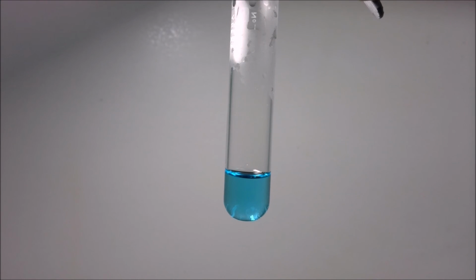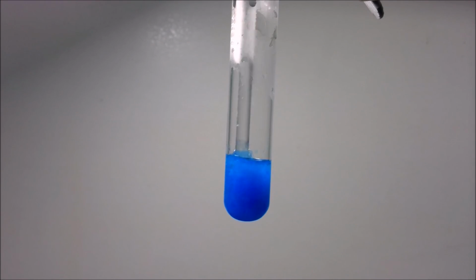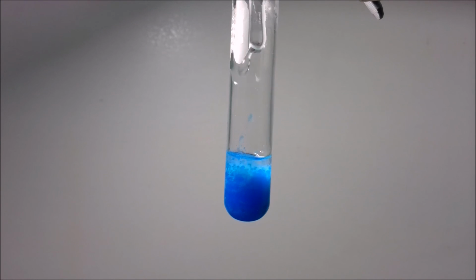To reproduce the solid again, we add some more sodium hydroxide. This time, when we stir it up, the solid does not completely dissolve. We now need to separate this solid from the liquid. For that, we are going to use a centrifuge. We rinse off our stirring rod to make sure we don't have any solid left on that. And next, we're going to take it over to a centrifuge.